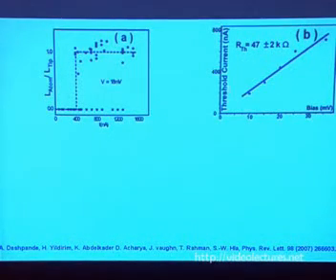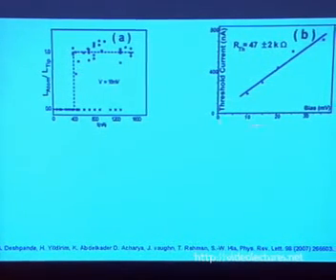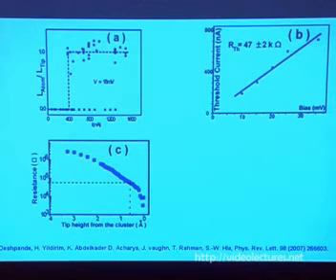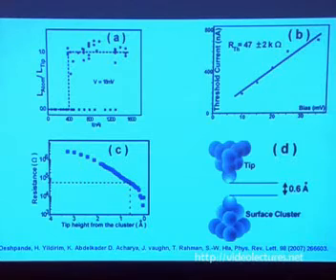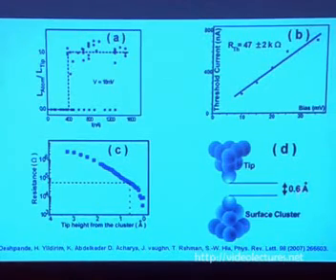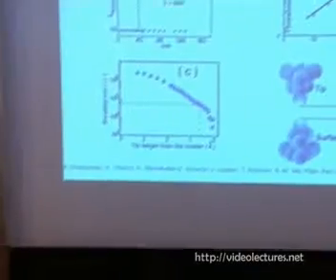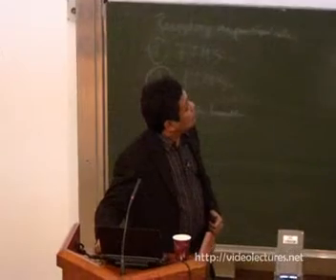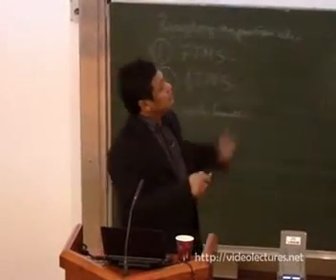If we plot the threshold voltage and current, we get a linear relationship. From the slope, we can measure the threshold resistance, and from that resistance, we can convert to the height by using IZ spectroscopy. And we measure it here. It turns out that the distance between the tip apex atom and the cluster atom has to be 0.6 angstrom or less if you want to pull out the atoms. How reliable is this technique? I will show you here. We can pull out the atoms one at a time, repeatedly, from a cluster, as many as we wish.